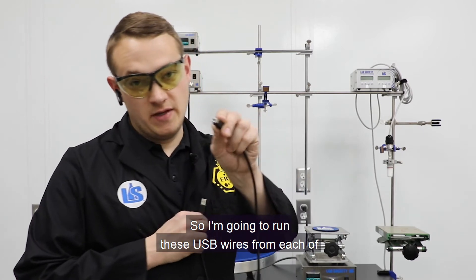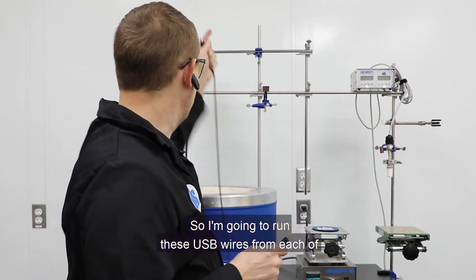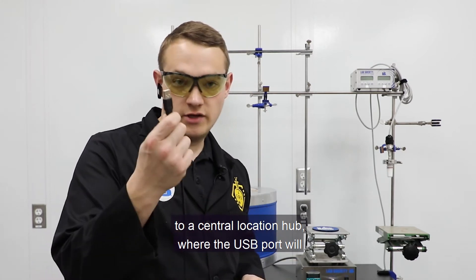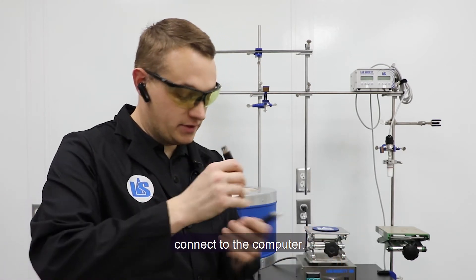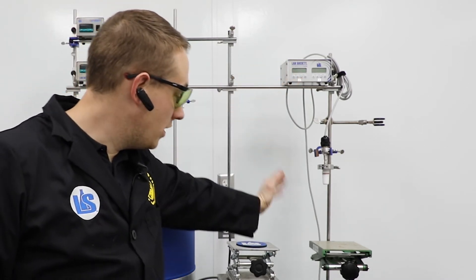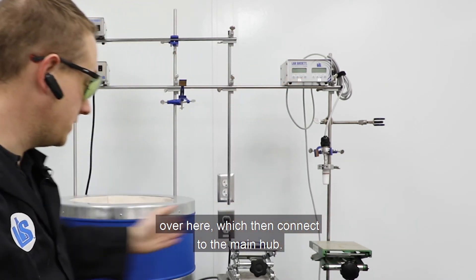But today I'm going to set it up as if I don't have an Elite Lab core kit because I'm using a more makeshift frame. So I'm going to run these USB-B wires from each of these controllers to a central location hub where the USB port will connect to the computer. And then for those, it's going to be mini USB that will go into their own hub over here, which then will connect to the main hub.